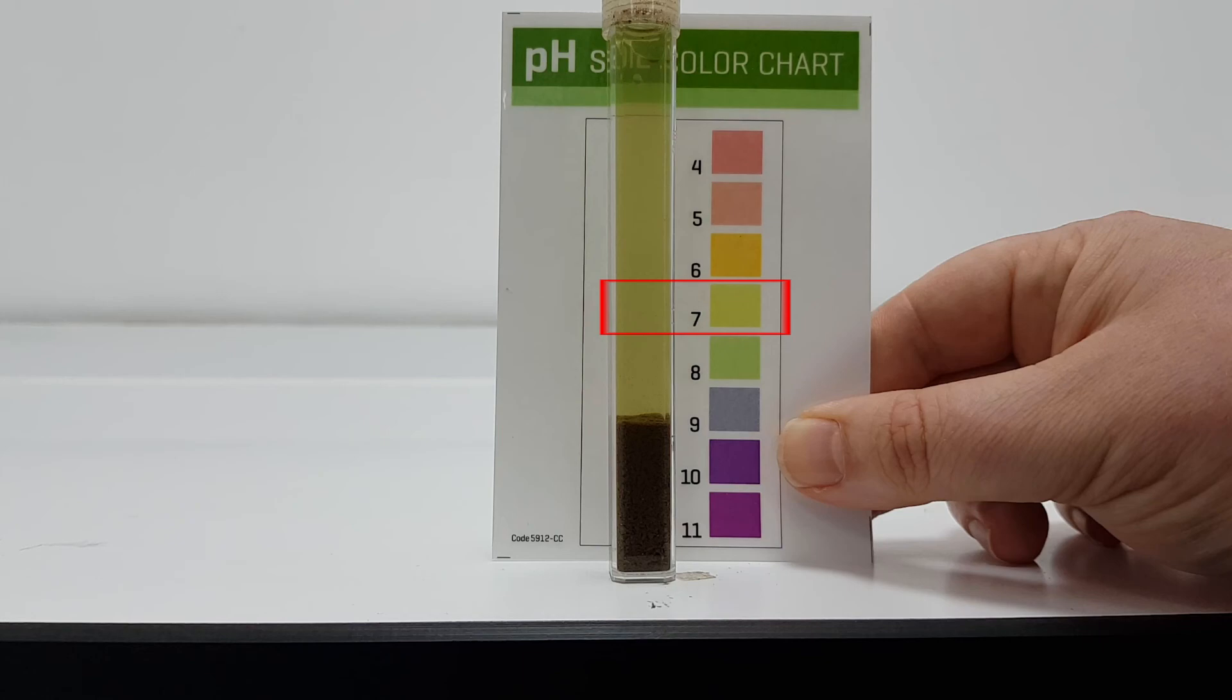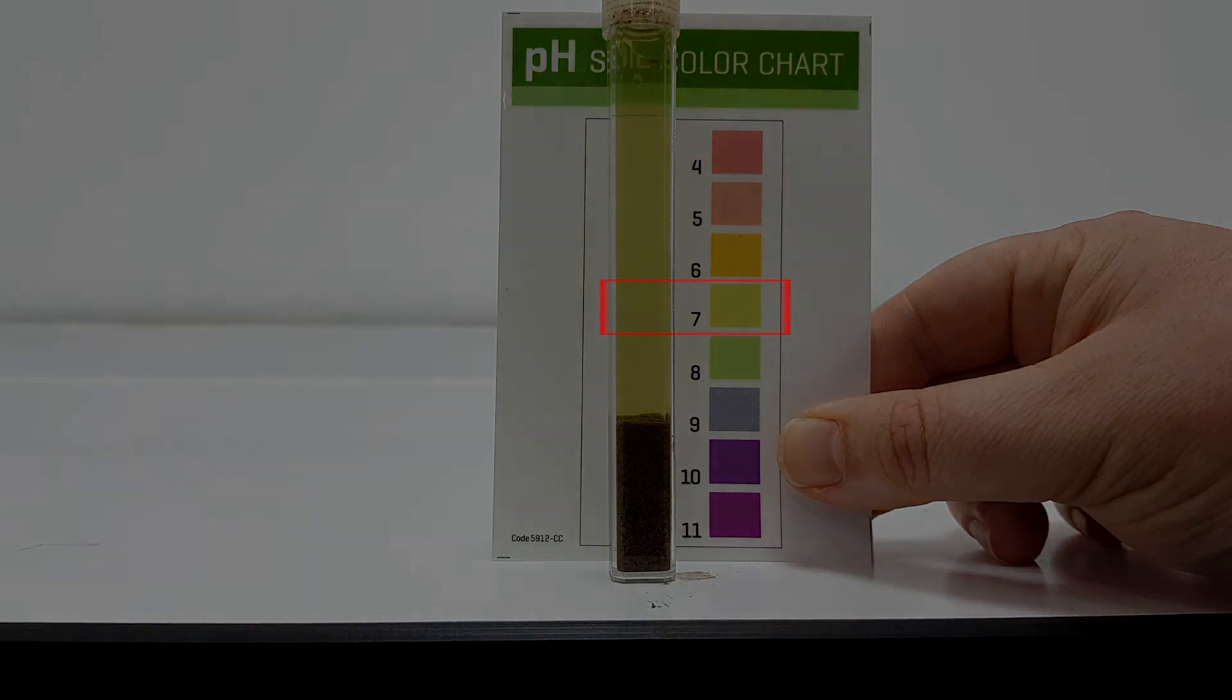Once you've taken your readings, thoroughly wash out all of the test tubes that you've used and put everything back into the box.